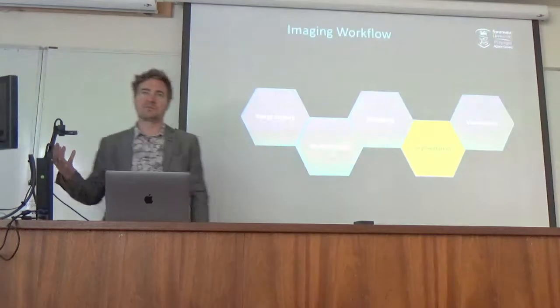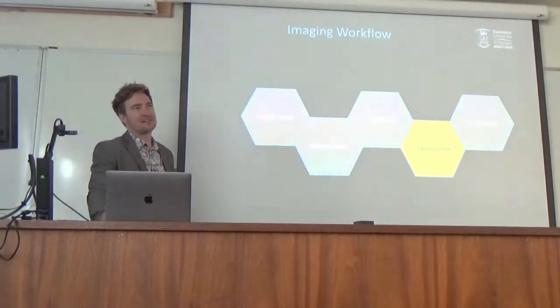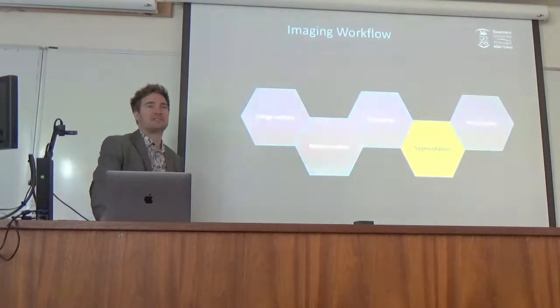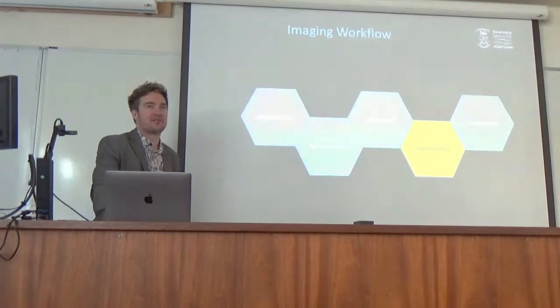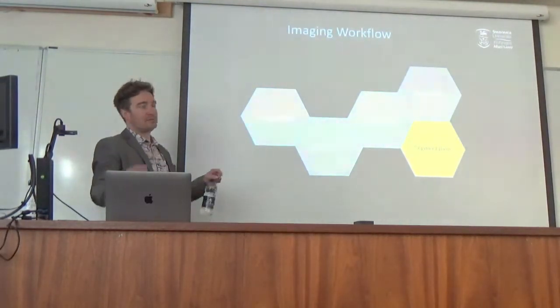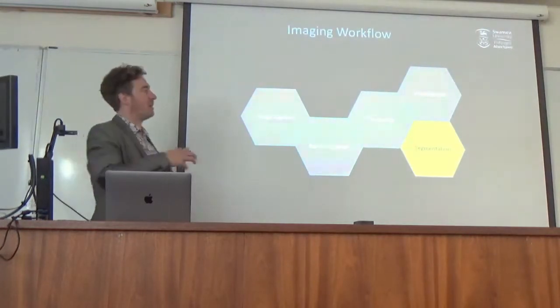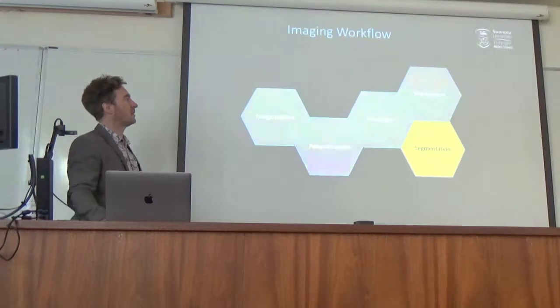Not on everything, some things are easy, but more and more segmentation, either of complex data sets or massive multiple 4D data sets, and automating that is going to be where we can benefit as a field. But I also think that can be helped by moving visualization to a part of the segmentation. So rather than just looking at slice data, you consider the whole.